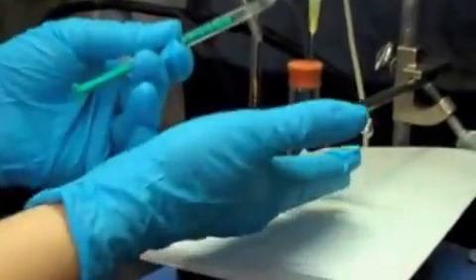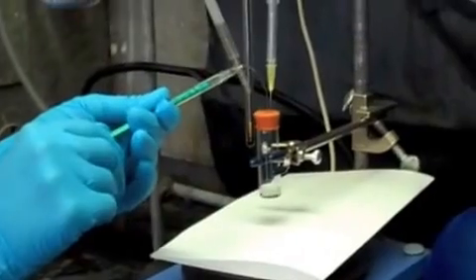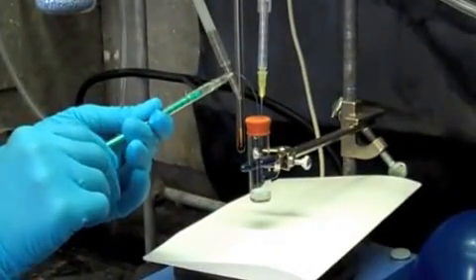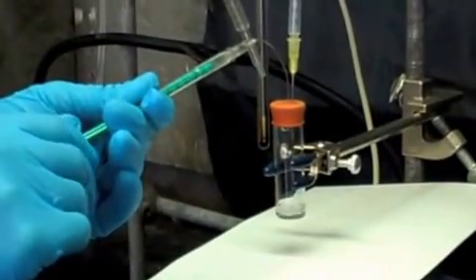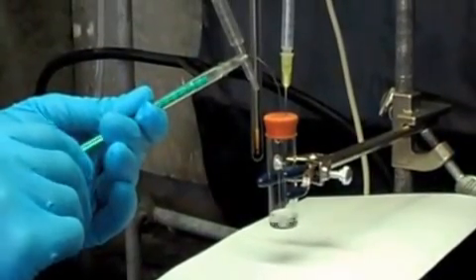You should perform the titration slowly because there is a chemical reaction going on here. We'll add our solution dropwise, as we should for all solutions. And I am just twisting the barrel of the 1 ml syringe. This is a great trick. If you twist the barrel and push just slightly, it allows you to do dropwise delivery.